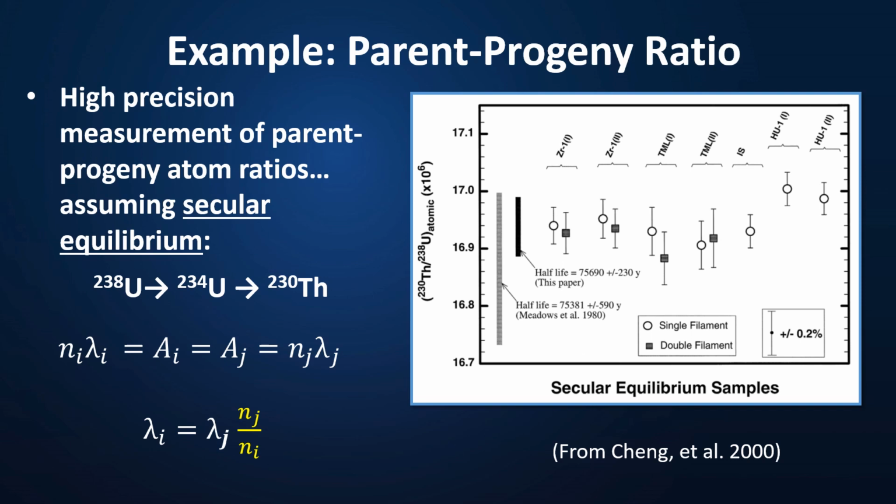This graph shows their results for the thorium-230 U-238 ratio measurements on a Table Mountain latite rock standard and on zircon, Iceland spar calcite, and uraninite mineral samples.